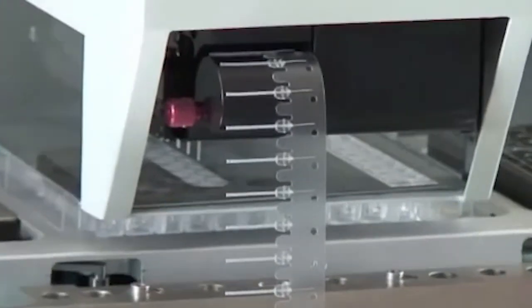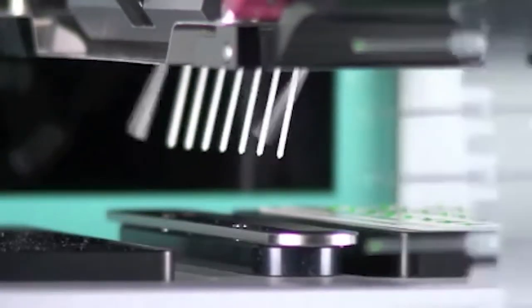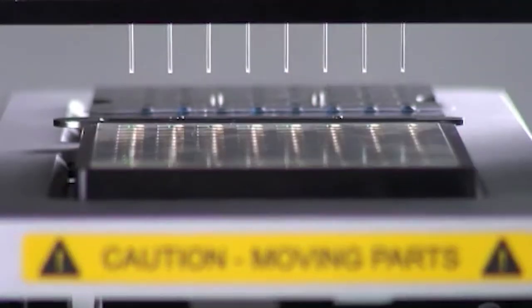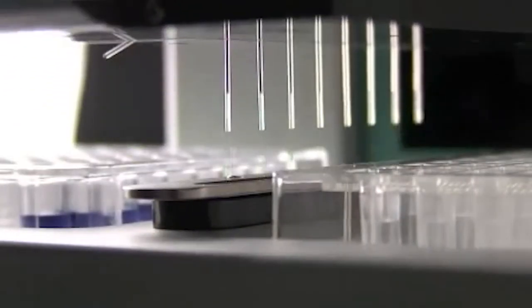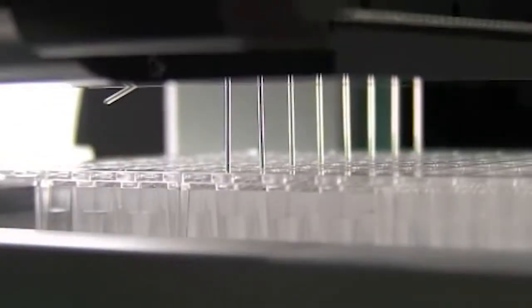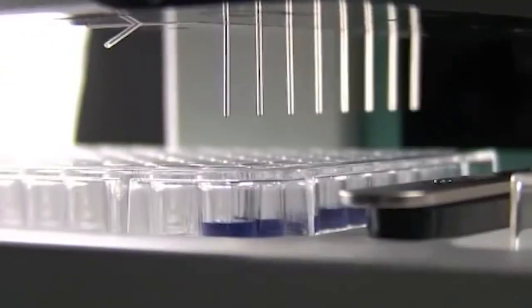At the heart of the Mosquito system are its disposable positive displacement pipettes. This is completely unique for an automated pipetting system and it means that there's no system liquid and no air gap between the piston that's moving the liquid and the liquid itself. This gives us unrivaled pipetting accuracy and repeatability, particularly at low nanoliter volumes compared to any other system across a huge range of viscosities and surface tension liquids.